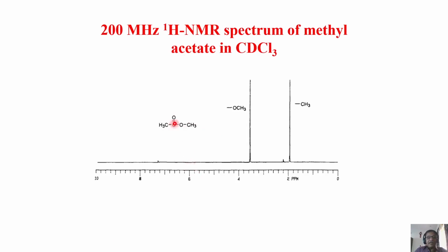But interestingly, this CH3 is not directly attached to oxygen. So this CH3 comes here.